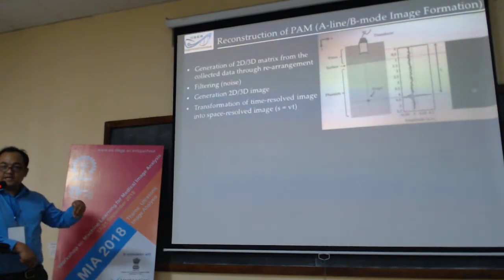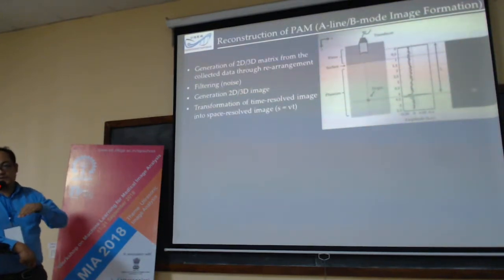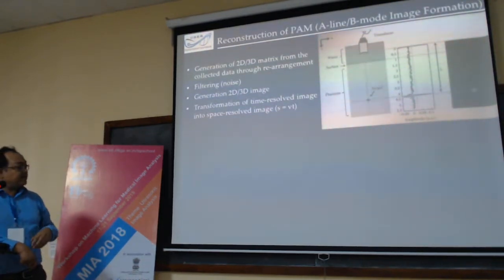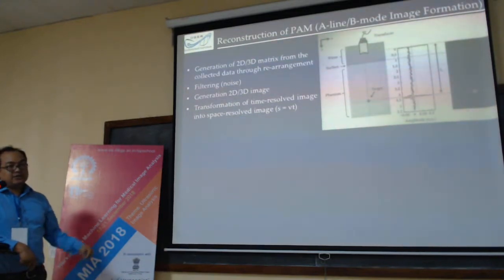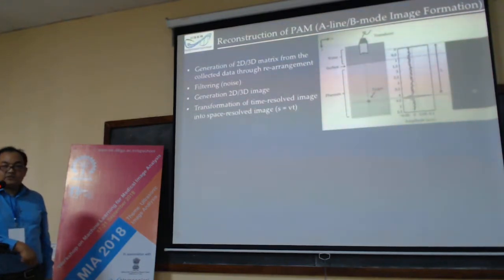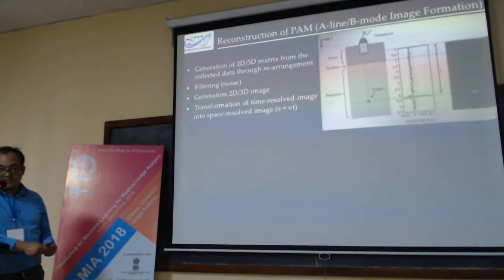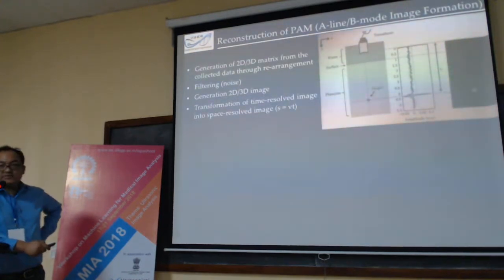The reconstruction is not rigorous. The 1D signal, as it is written in the computer, you have to unwrap it, so whatever the signal, you have to arrange it into a 2D matrix or a 3D matrix. And then, of course, we need certain filtering. It is quite associated with the noise that I came across. The transducer picks up noise from the environment, and it is very sensitive to any breakage in the cable, which we have to take care of.